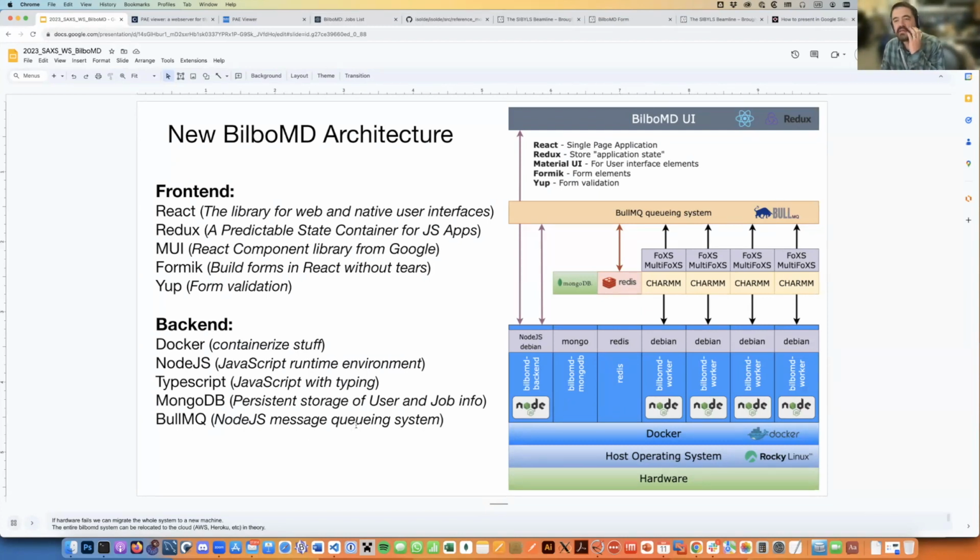Yeah, that is an aspect of this that I've sort of neglected. I think I need to revisit that bit of code. I asked Mikkel what logic I should use for returning PDB files to the user, and I don't think I followed up, or he gave me a confusing answer. So I just included everything and left it to you to figure out.